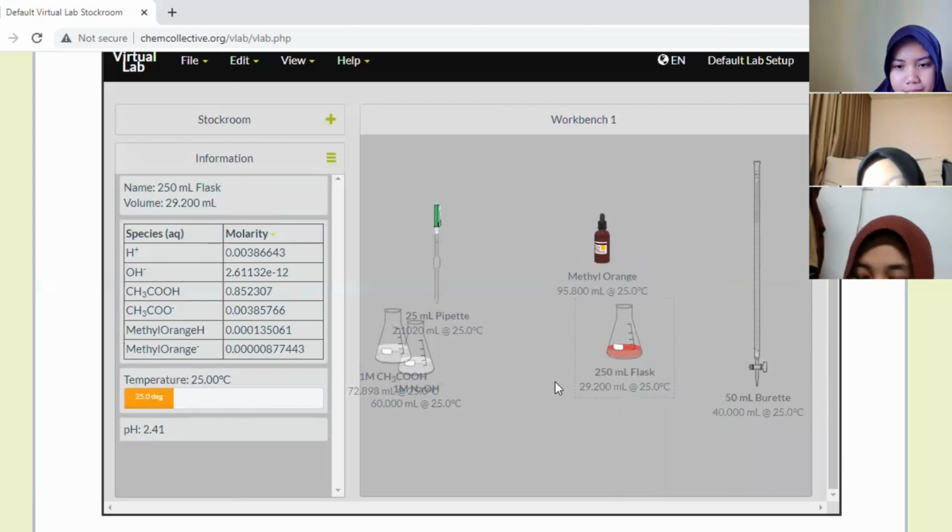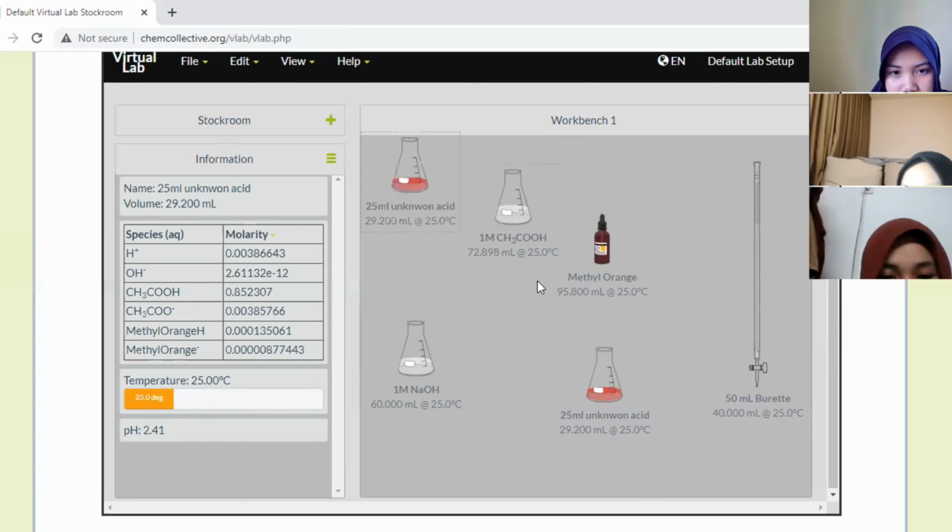Make another solution the same way. Okay.